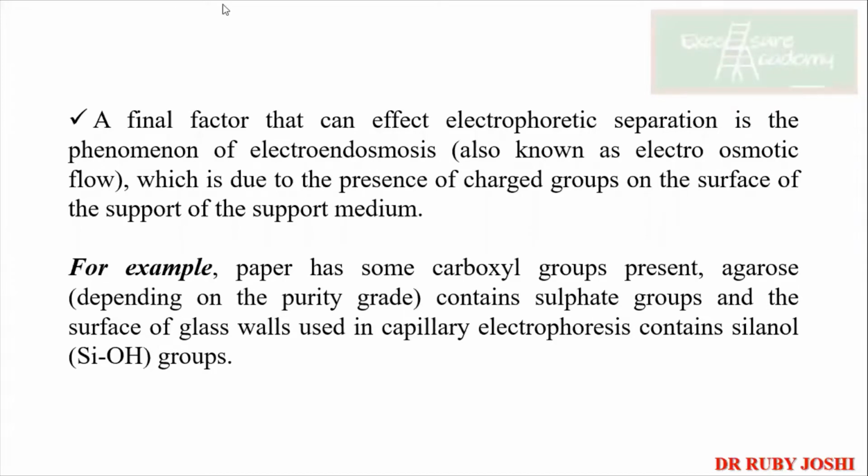Okay, so now there is one more important factor which is affecting the electrophoretic separation, and that is something known as electroosmosis, which is also electro-osmotic flow. Now this is happening because of the presence of charge groups on the surface of the support medium.